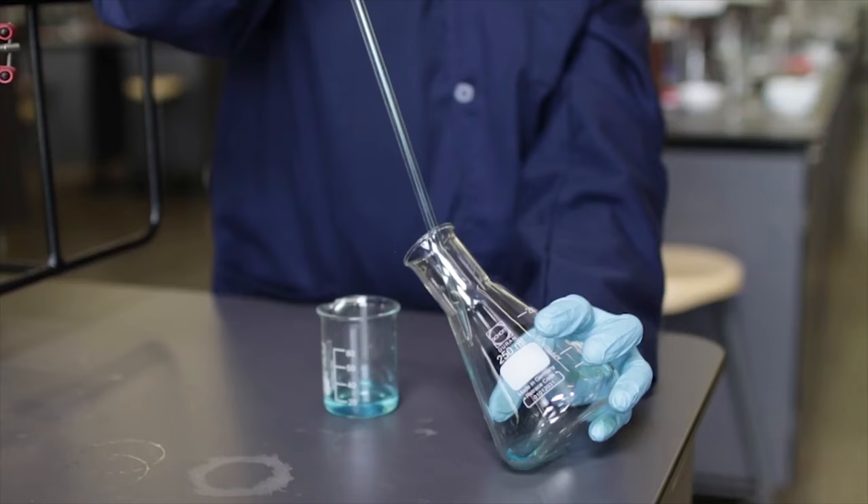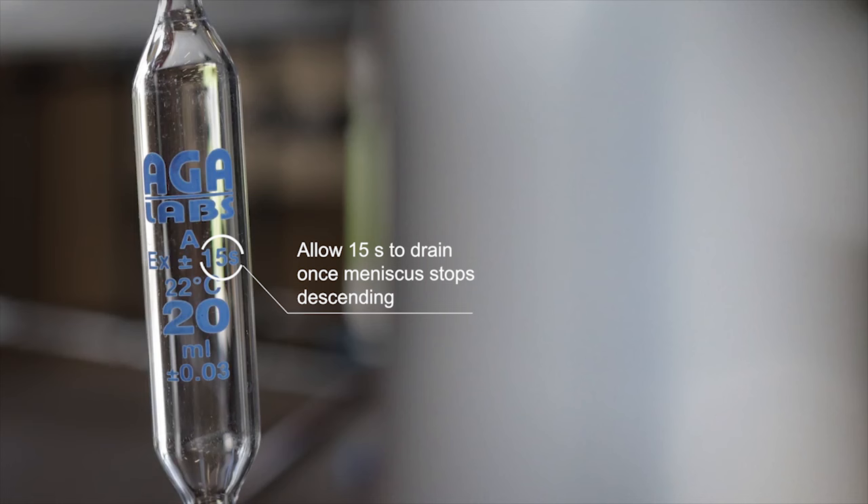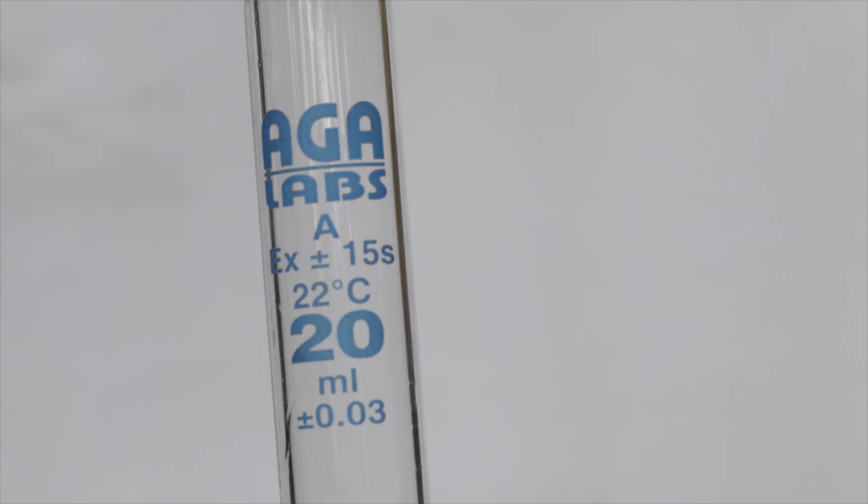The solution is drained into the conical flask by placing the tip of the pipette on the side of the flask and pressing the rectangular button on the pro pipette. On the bulb of the pipette, there is a value given after EX. This value represents the time that should be allowed to drain once the meniscus has stopped descending. This is an estimated time done by counting, allowing for slightly longer time rather than less.